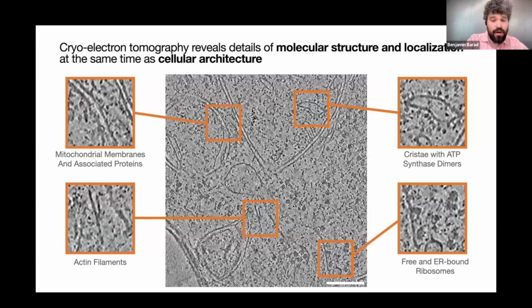In my postdoctoral work, my job was trying to investigate mechanisms of fission. And you get a beautiful picture like this that I think is immediately very attractive. You can see the mitochondria on this.